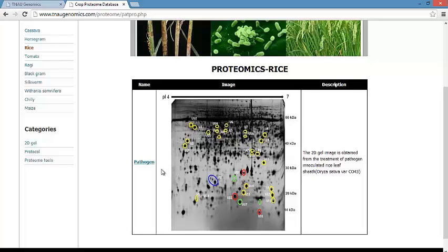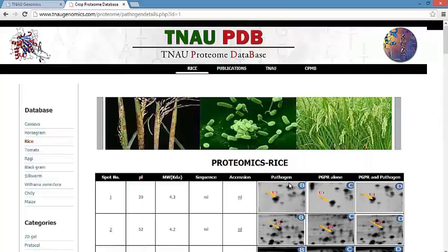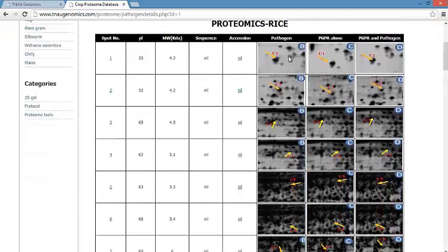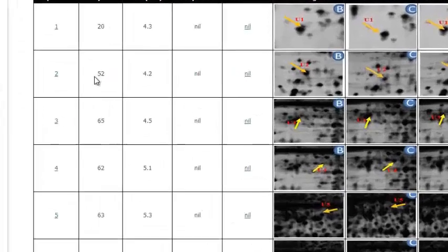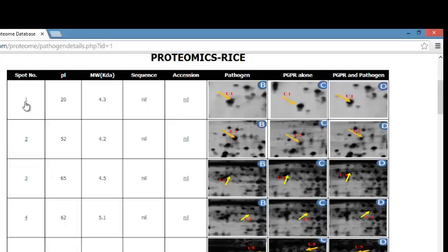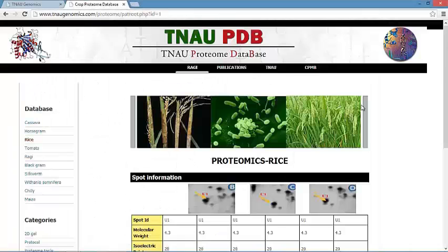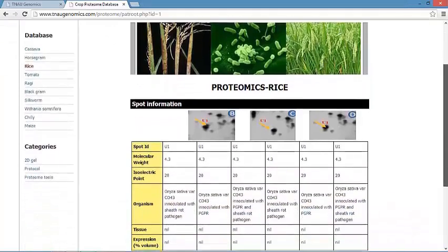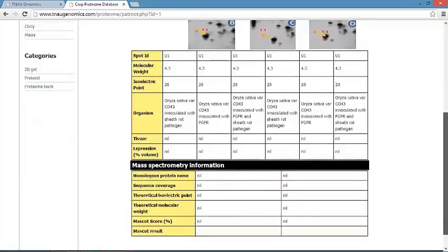Four treatments are carried out: healthy, pathogen-infected, pathogen with PGPR, and PGPR alone. PGPR is plant growth promoting rhizobacteria, which promotes plant growth by reducing the pathogen's effect. The downregulation is induced by either pathogen alone or pathogen and PGPR, similar to downregulation patterns. Each protein can be clearly described and the spot number gives further information about the spot.